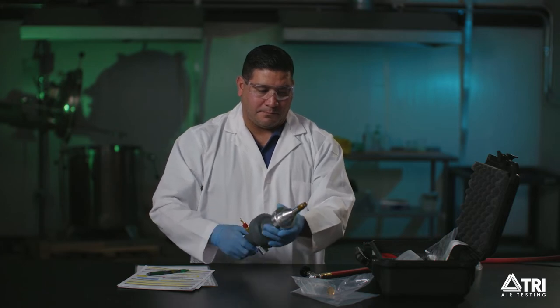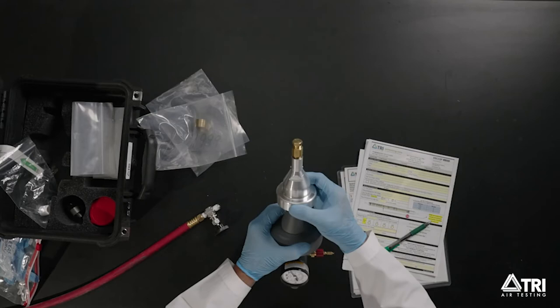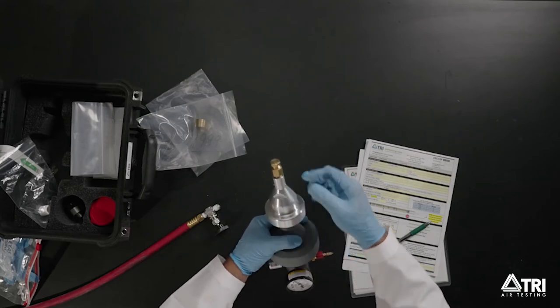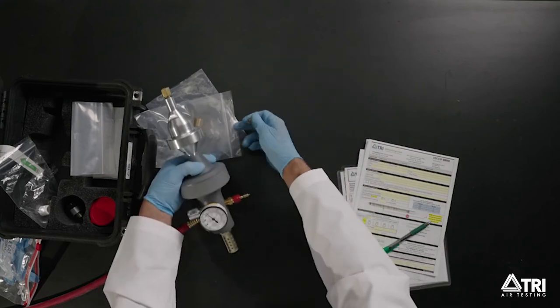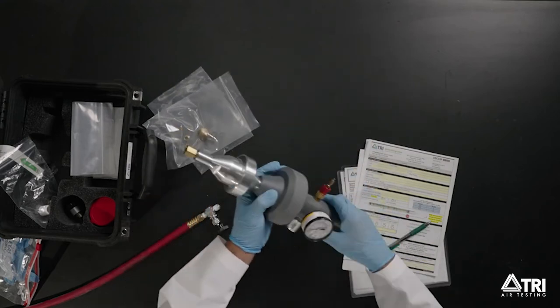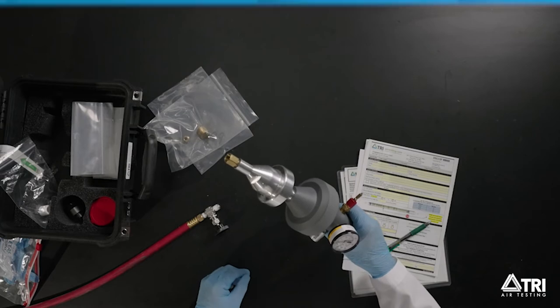It's important to make sure the filter union and the Champion 35 are screwed in together properly. Double check this before attaching the completed assembly to your air source. Remove the plug from the other end of the union and place in the plastic bag.